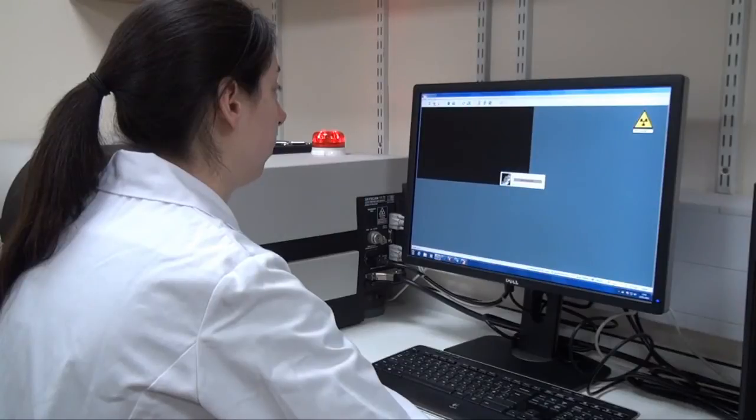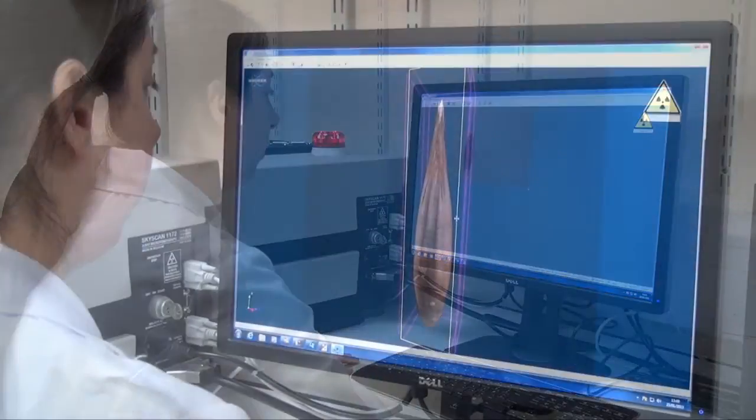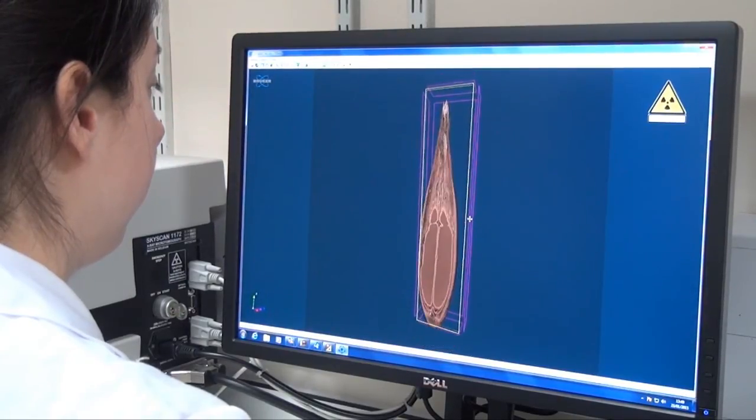X-rays are passed through the sample and recorded with an internal camera. Several hundred images taken as the sample is rotated are used to reconstruct a 3D image.